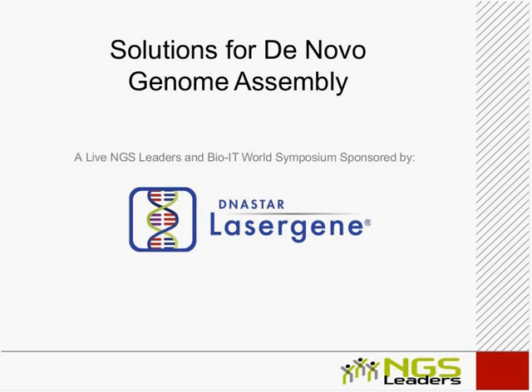Were you referring mostly in your remarks to eukaryotic genomes, or could many of your remarks also apply to bacterial de novo genome projects? That's a good question. Mostly what I'm talking about is eukaryotic genome projects. Bacterial genome projects are a little different because you have, with these new next-generation sequencers, probably way too much sequence to assemble, and so a lot of times you would be doing that in some kind of metagenomic setting, and that's a completely different problem because the sequences there are very different copy numbers, et cetera. So I'm really focusing on eukaryotic.